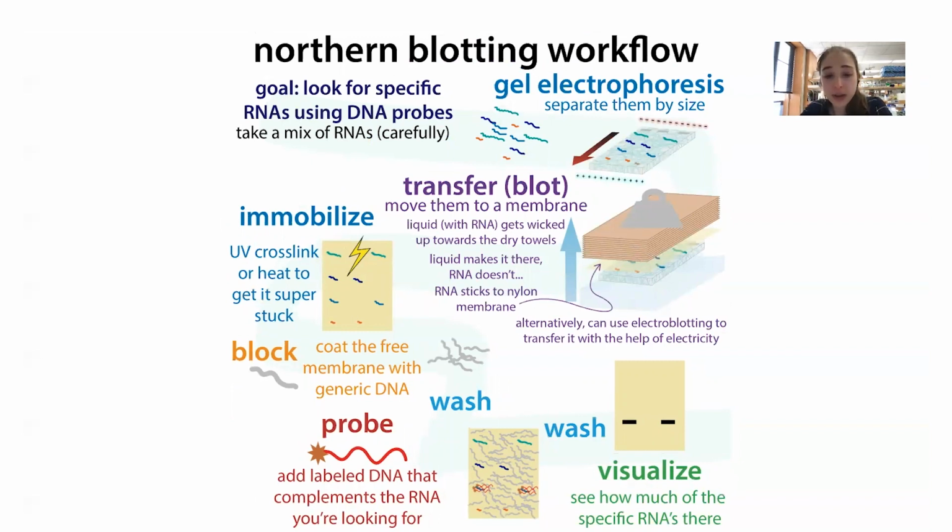So your probe is going to be complementary to that sequence. You're going to send in this probe, and then you are going to wash off the free probe, and then you are going to visualize it. And so see how much of that specific DNA or that specific RNA was there and where it's located in the gel. So now let's talk a little bit more about some of the details with these various methods.